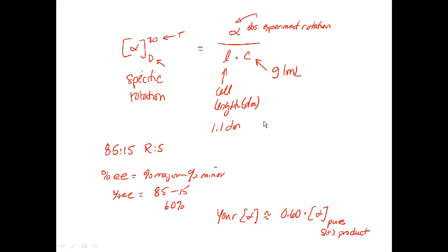Okay, so this is a 2-week experiment. First week, just set up the yeast reduction. Second week, analyze the products. If we have an overabundance of time, which I'm thinking we won't, then we may analyze the product by GC, but I think we're probably just going to analyze its purity by the specific rotation as well as the IR.